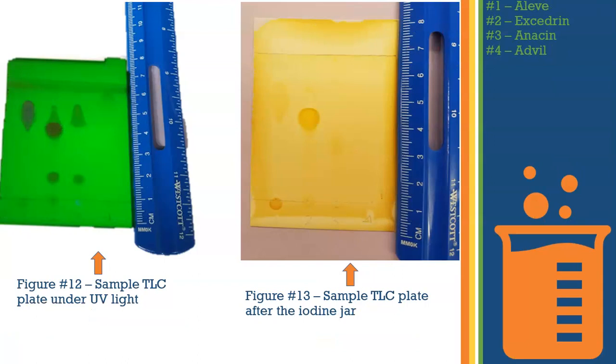Figure 12 shows the sample TLC plate viewed under the UV light. And figure 13 shows the sample TLC plate after it was exposed to iodine in the iodine jar.